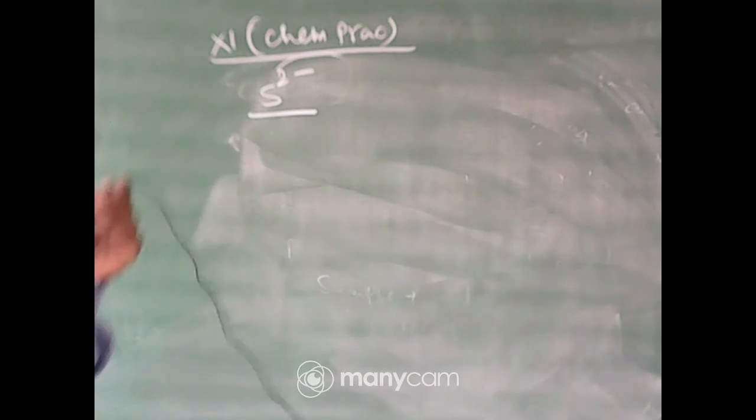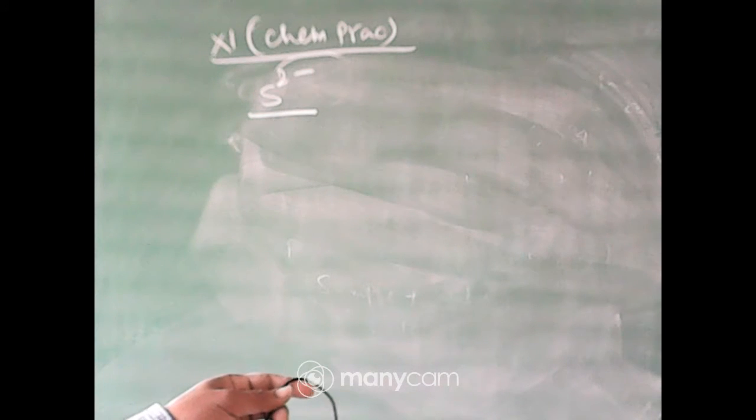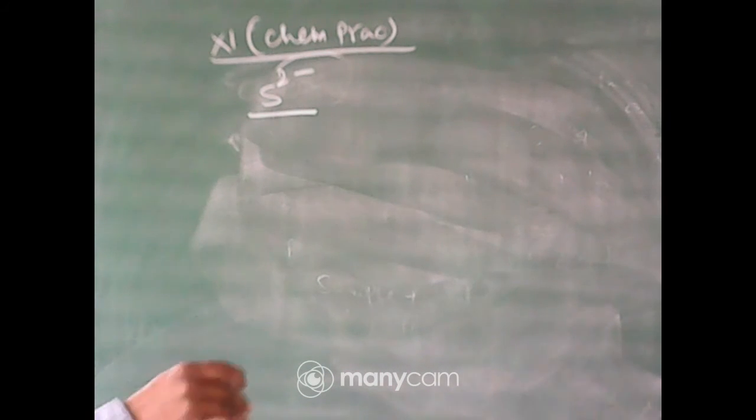I can show you. You can see that residue is there. But now there is no residue, it is a clear solution. So this is kept reserved.